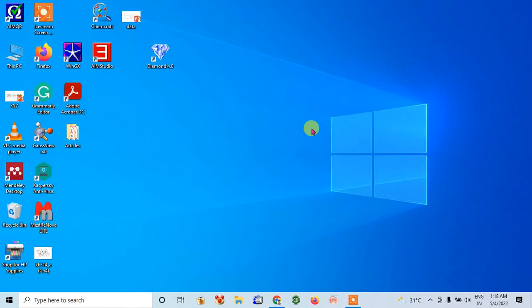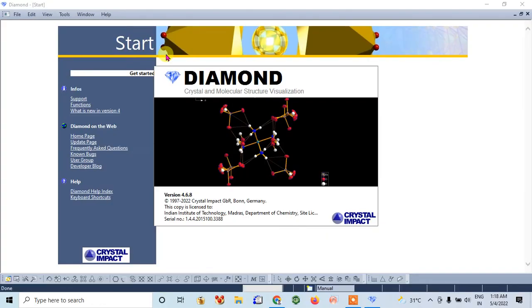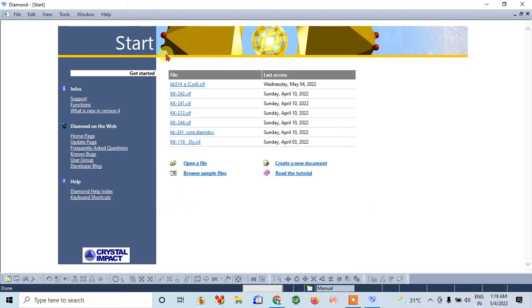Okay, so today in this video, I'm going to tell you how to make beautiful pictures of your molecules using Diamond software. First of all, you need to download this software from the internet. It is freely available. You can download a trial version for free. Now I have already downloaded and installed it on my computer.